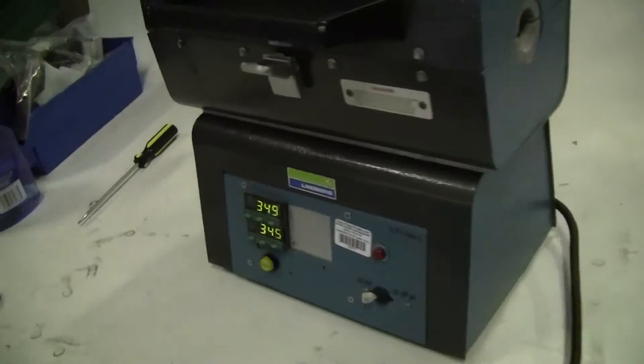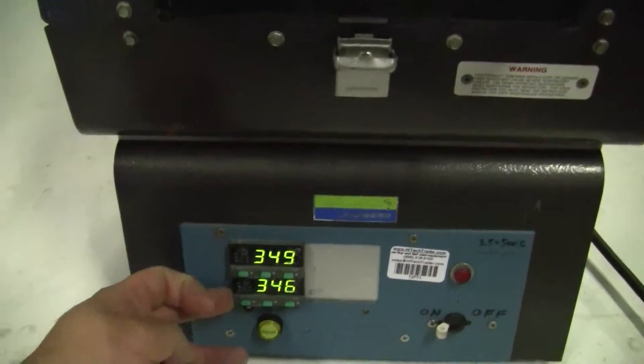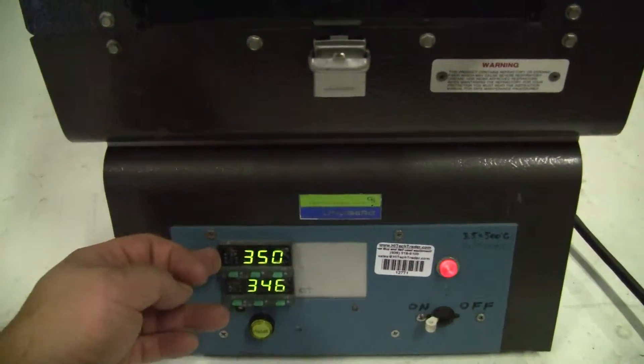We have two controllers. It's been retrofitted. One is an over temp, one is your primary.